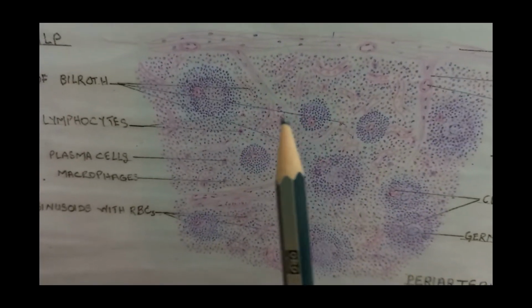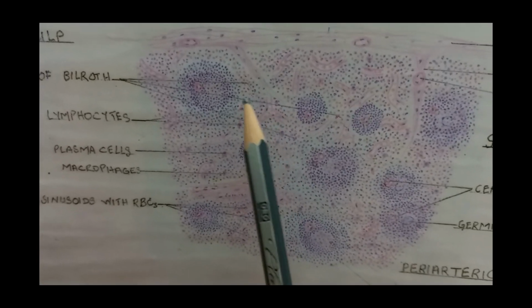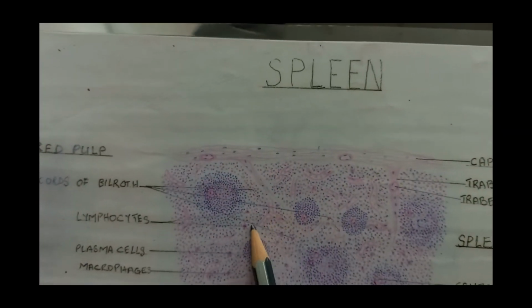Then we have the splenic sinuses. These are the splenic sinuses. As you can see, these were the splenic cords and these are the splenic sinuses.